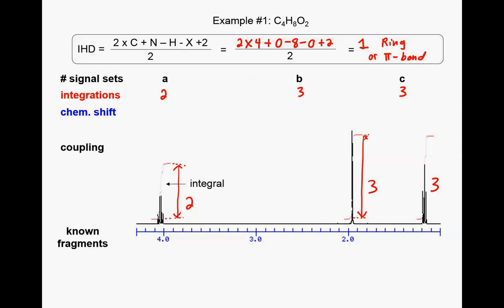Yeah? How do you know that it's 2, 3, 3? So basically, do you see how this one kind of adds up to roughly 2/3 of this peak over here, or at least the integration here of the red? You'll have these numbers on a problem. They're just not showing up really well on this. There's these practice examples I found that don't come with the numbers, so that's why I'm giving you 2 and 3 and 3 here.